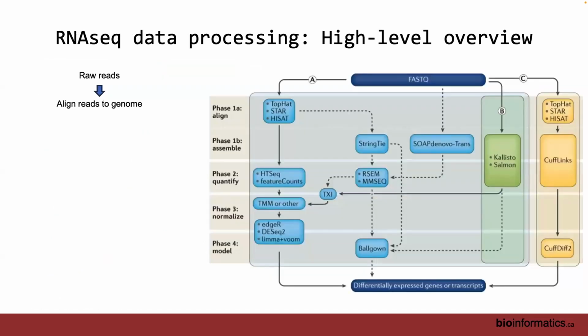Okay. So now we have gone through that process and we have generated data. The raw reads that come off the sequencer are a set of strings. They're just letters. We don't know where in the genome they correspond to. Somehow you have to put them through a pipeline, and at the other end, you get a nice table of gene expression by samples, right?